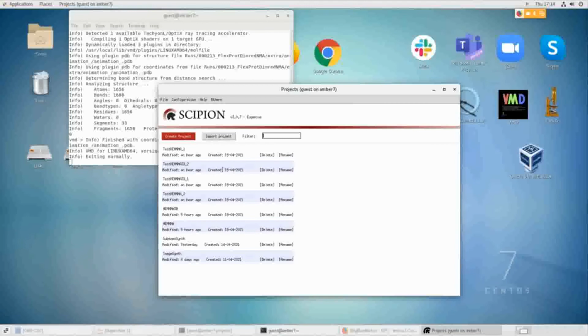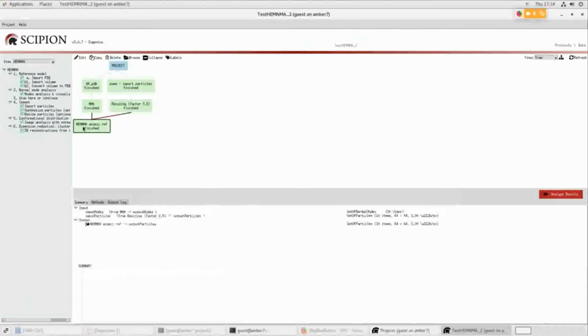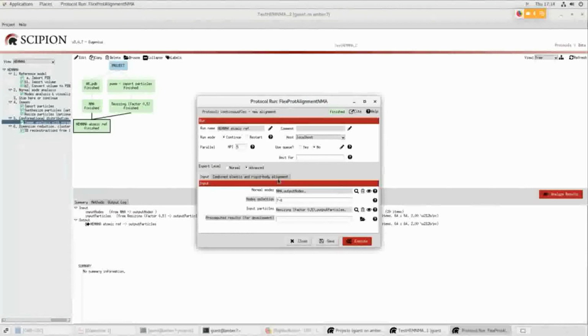So this is the first protocol, the first test, and the second test, as I said, we are going just up to this step that is image analysis, and we are really performing it. This is to test your MPIs.